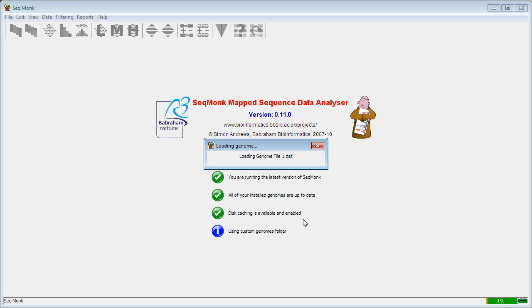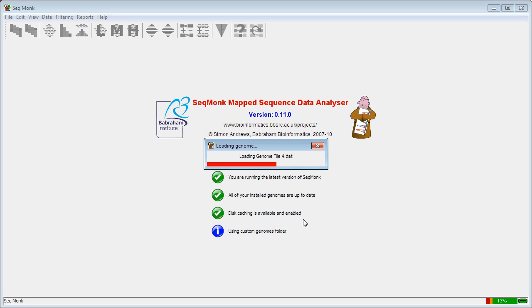The first time you load a genome in, it will take a few seconds for SeaMonk to parse the genome and to sort out the annotations, but on subsequent loading it should be pretty much instantaneous. Once the genome is finished importing and you can see the genome browser view appear, then we can start to bring some data in.